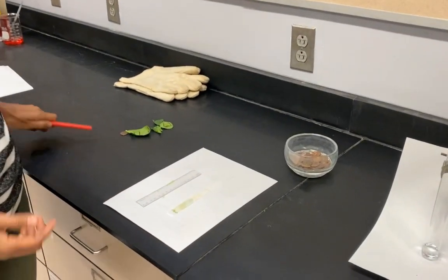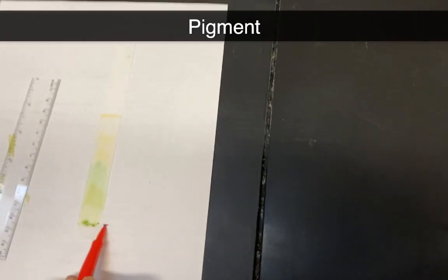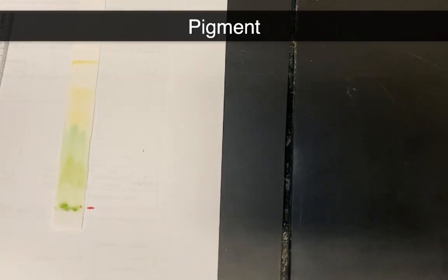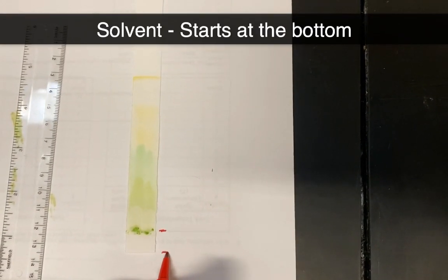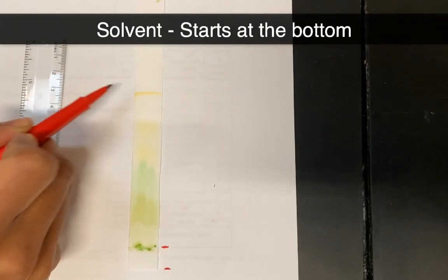And so if you remember, we had a mixture that started right over here, and that was spinach juice, which had all the different pigments that are found inside the chloroplasts. And we had our solvent that started down here and moved all the way up to this orange line.